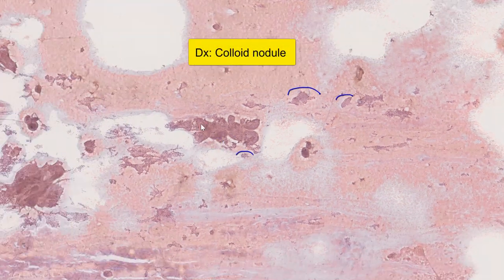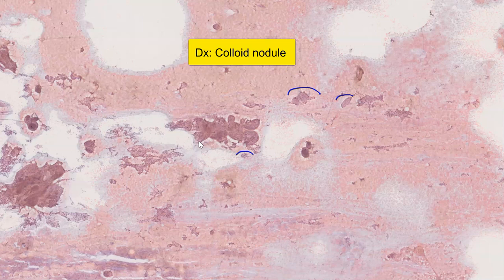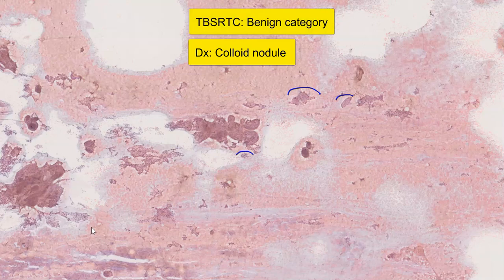So this is an example of a colloid nodule. We have intact tissue fragments composed of follicles, flat honeycomb sheets of follicular cells, and abundant thin colloid in the background. This would be classified in the Bethesda system into the benign category.